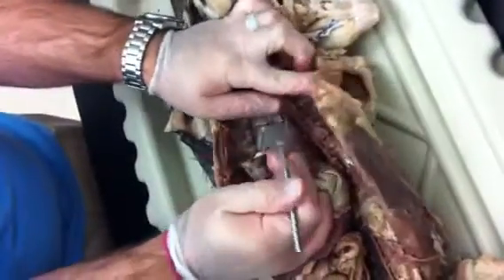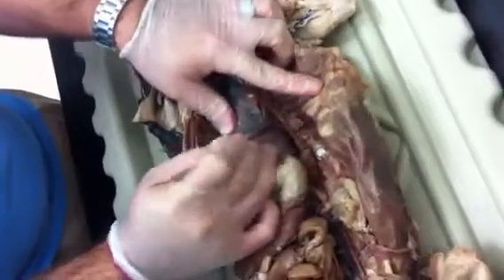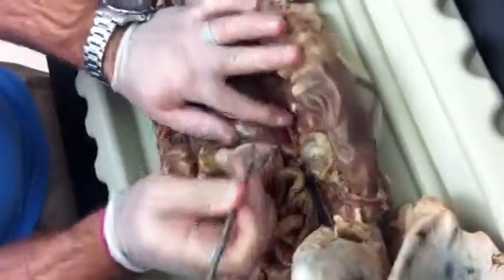Okay, so then the aorta makes a curve down. This is going to be hard for y'all to get on video. It makes a curve down in the back of the chest. It comes to the thoracic aorta. Right, you can see it there. Runs through the diaphragm, which we've torn out of the place, and then does some branching.